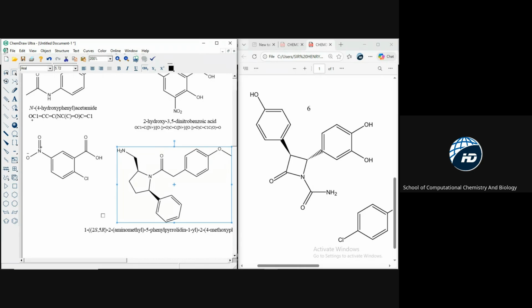Please, ma, you said you are not able to generate your name for your structures, right? Have you tried it again? Yes, I have. It's still saying a name could not be generated for this structure. What could be the problem? Would you mind sharing your screen? Let me see what is happening there.